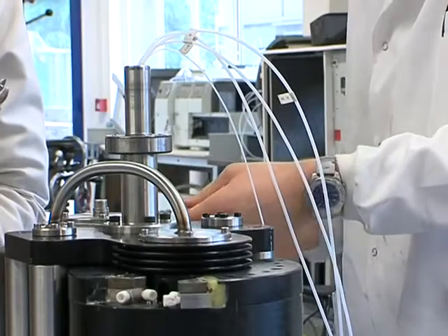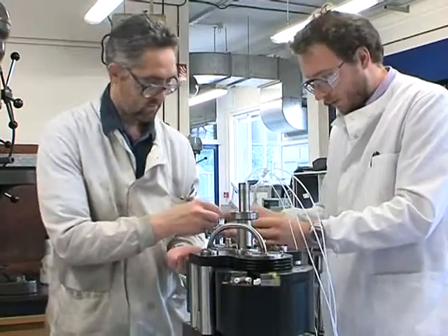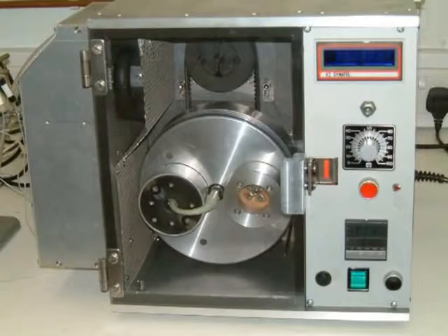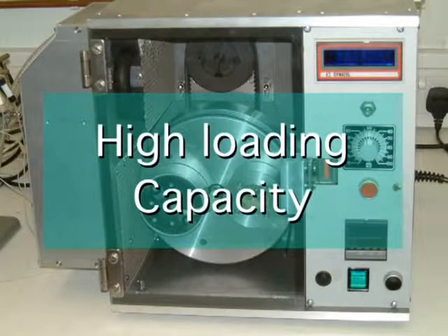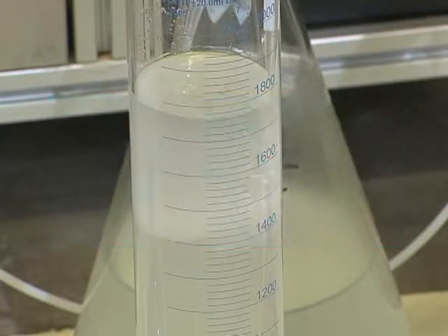Overall, the technique has a number of distinct advantages over traditional solid-phase chromatography, such as high loading capacity. Even the smallest countercurrent chromatography centrifuge of 5 milliliters capacity is capable of accepting an injection loading of 50 milligrams of crude material. No need to filter. Cell debris and particulates are tolerated. A one-step purification from a crude extract is possible.